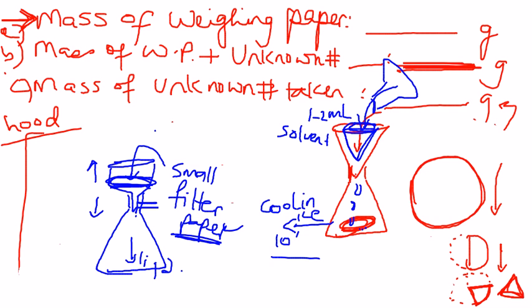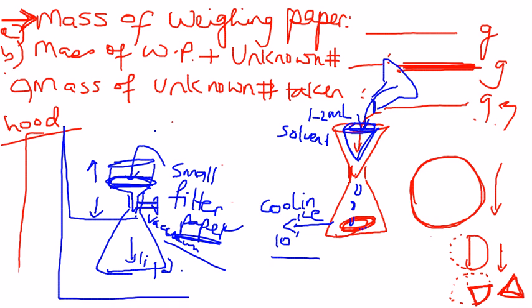You filter through a vacuum, because you want to make sure that it is nice and dry and ready to be taken a melting point off. Leave it at vacuum for about 3 to 4 minutes, and that's usually plenty to get rid of all the solvent.